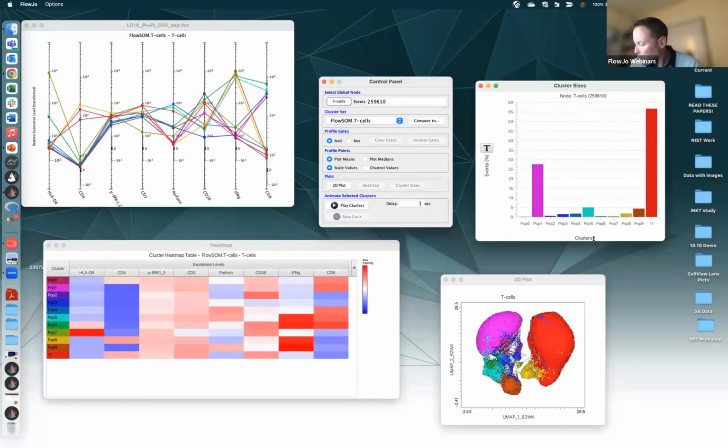Okay, reorder, expand the heat map. Okay, so that's just saying that we've done this here. You don't have to scroll anymore. Non-cluster pops, cool. Okay, I think with like 10 minutes to spare, I think that is the bulk of what I wanted to show you. I think we're okay here. That'll allow me a little bit of time. We can talk about, I think I showed the UMAP bit. Let me talk a tiny bit about what if I wanted to remove bubbles. Okay, but first, questions. Questions on any of the new stuff?